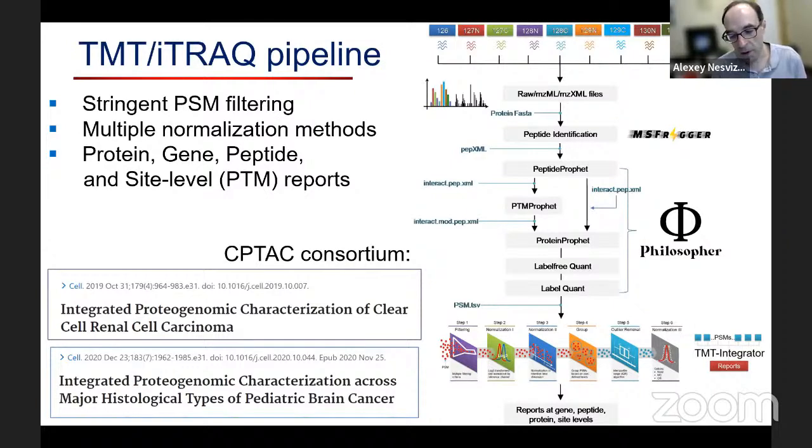Now, manual quantification, well, sure, if you're an expert person, you can look at the data and convince yourself that the tool is doing well. But you can only do so much manually. So we use strategies such as using LFQ bench, using multiple organisms mixed at known fractions, right? Or replicate runs, CV across runs. You can utilize those strategies. But if you're an expert mass spectrometrist, you can of course convince yourself by looking. You can load in Skyline, in other ways, and see if we are quantifying it well or not.